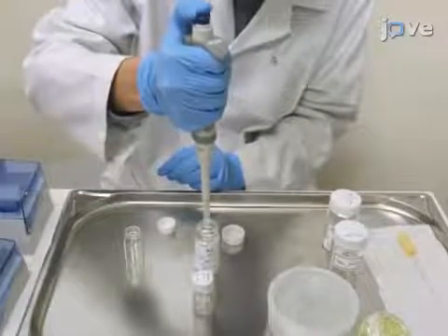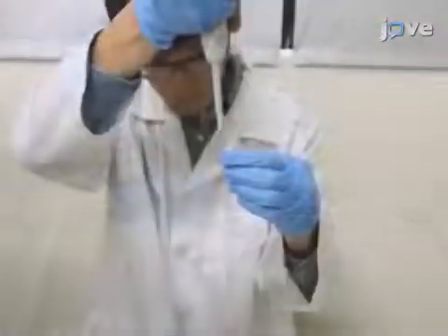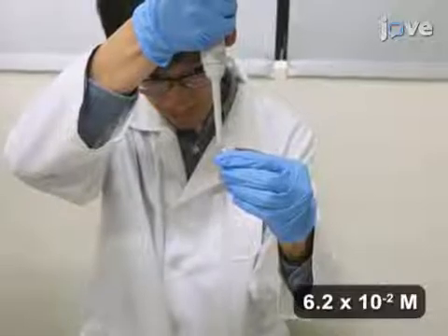To begin this procedure, prepare a stock solution of limonene in ethanol by mixing 10 microliters of limonene with 990 microliters of ethanol.